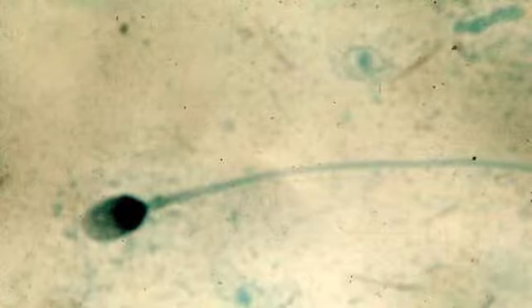The best way to identify a semen stain is to find a sperm cell. I'm sure that most of you have seen photographs or videos of sperm cells, and that's a human sperm cell. And so they're quite recognizable. They have that oval-shaped head and that long tail, and this one has been stained with a particular type of stain that changes the cellular material's color, but that's the appearance of it.